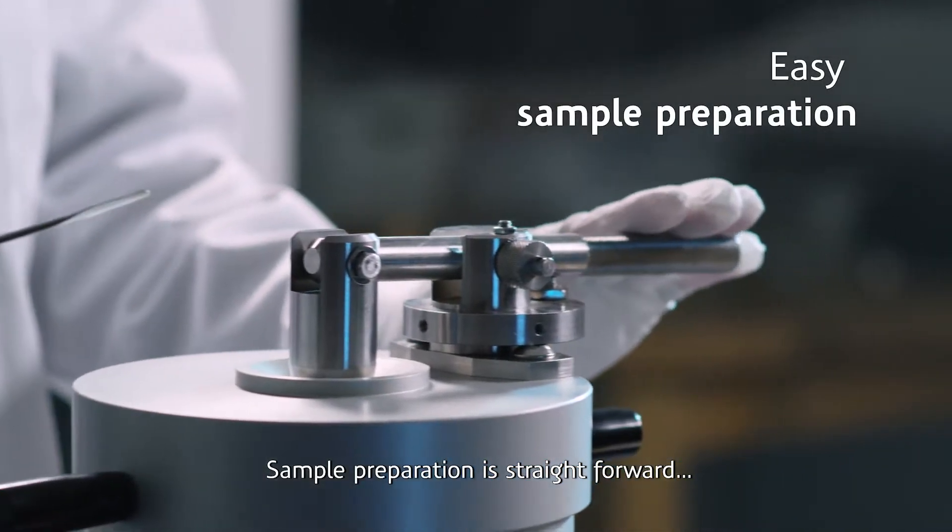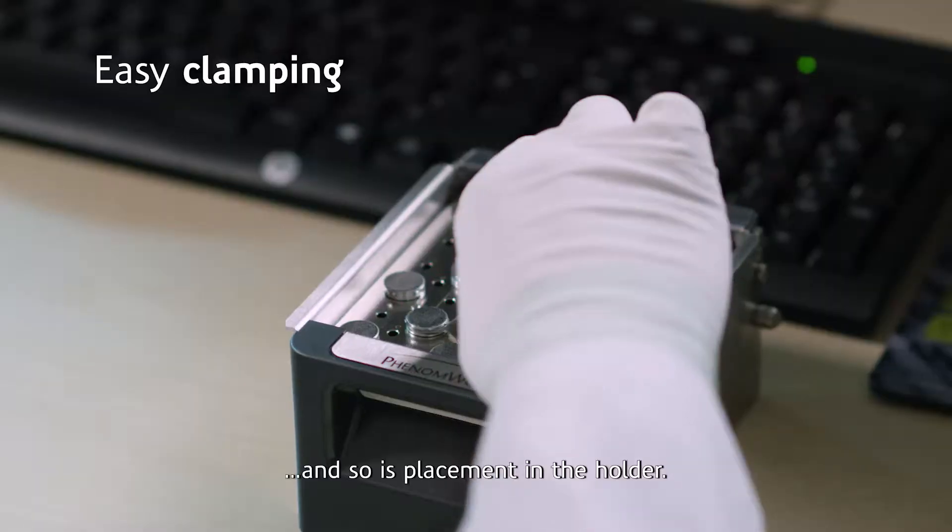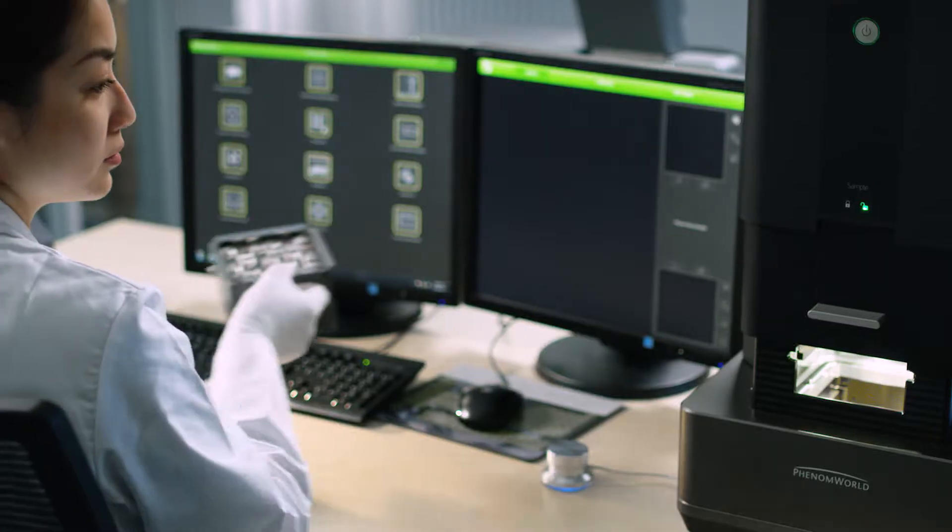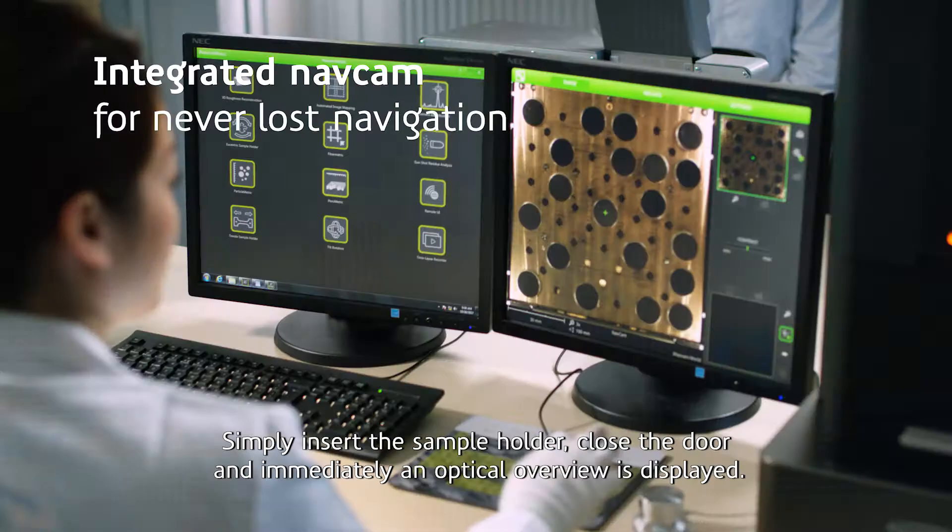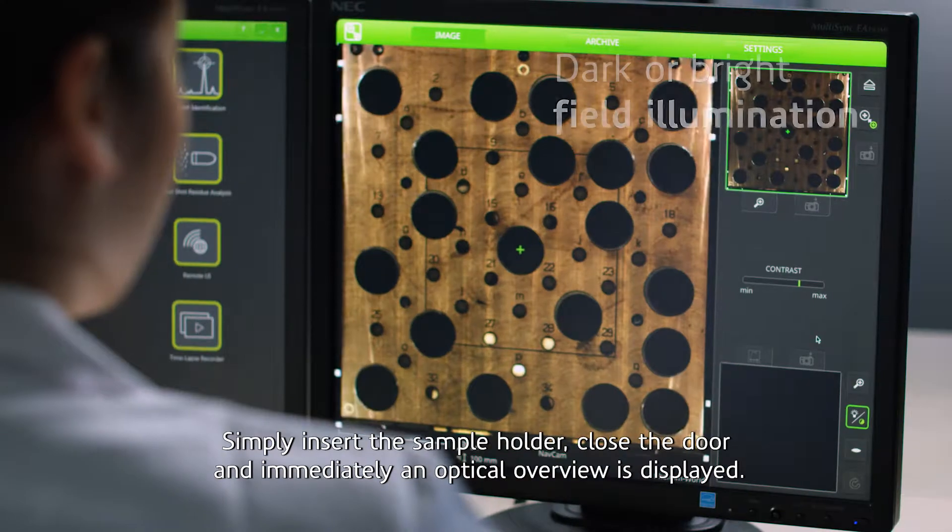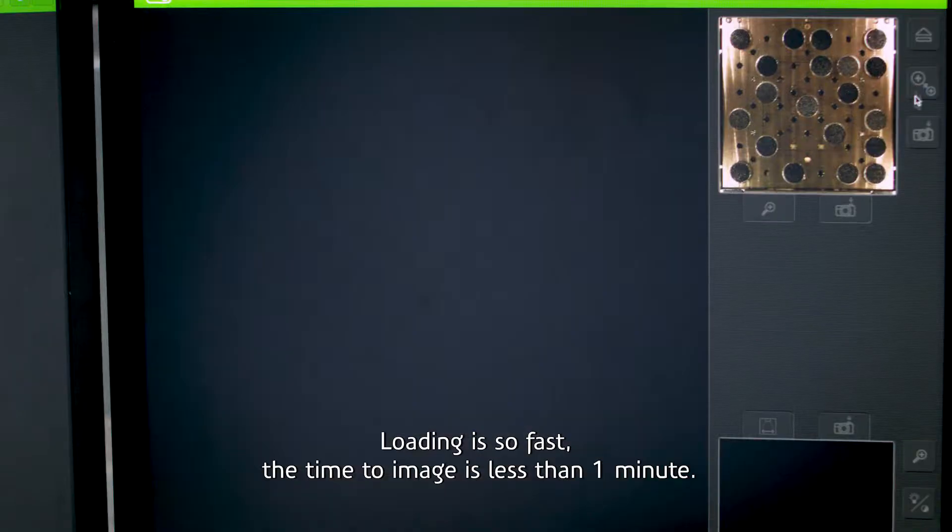Sample preparation is straightforward and so is placement in the holder. Simply insert the sample holder, close the door and immediately an optical overview is displayed. Loading is so fast the time to image is less than one minute.